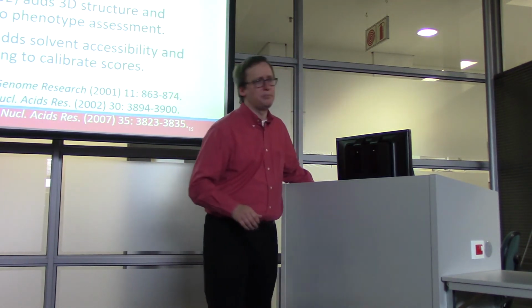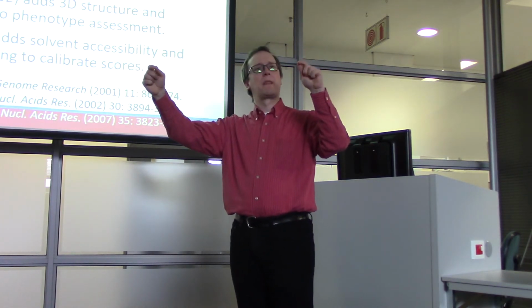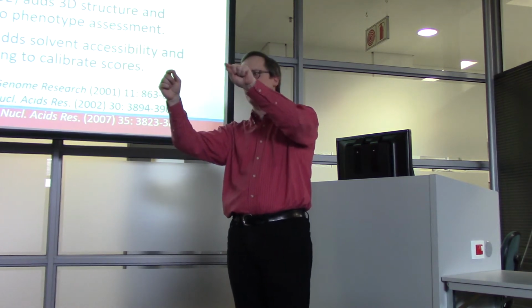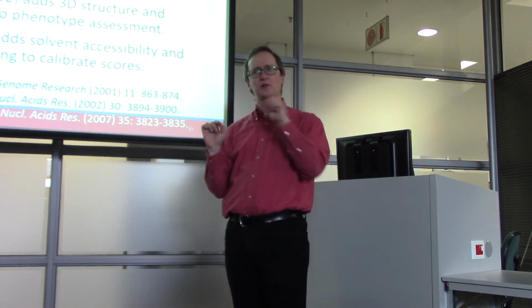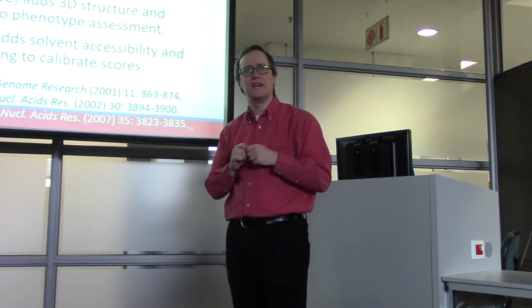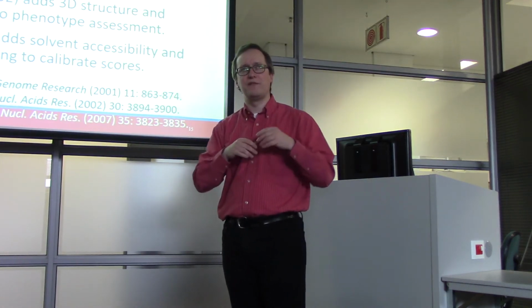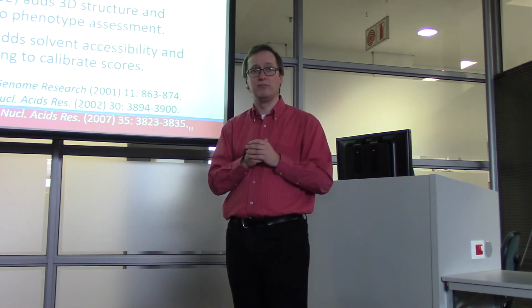In a case like that, I have some known gene from this species. Normally, the wild type sequence for this location has an S present. What I've observed, however, is a T at that position. Does it or doesn't it affect the function of that gene?